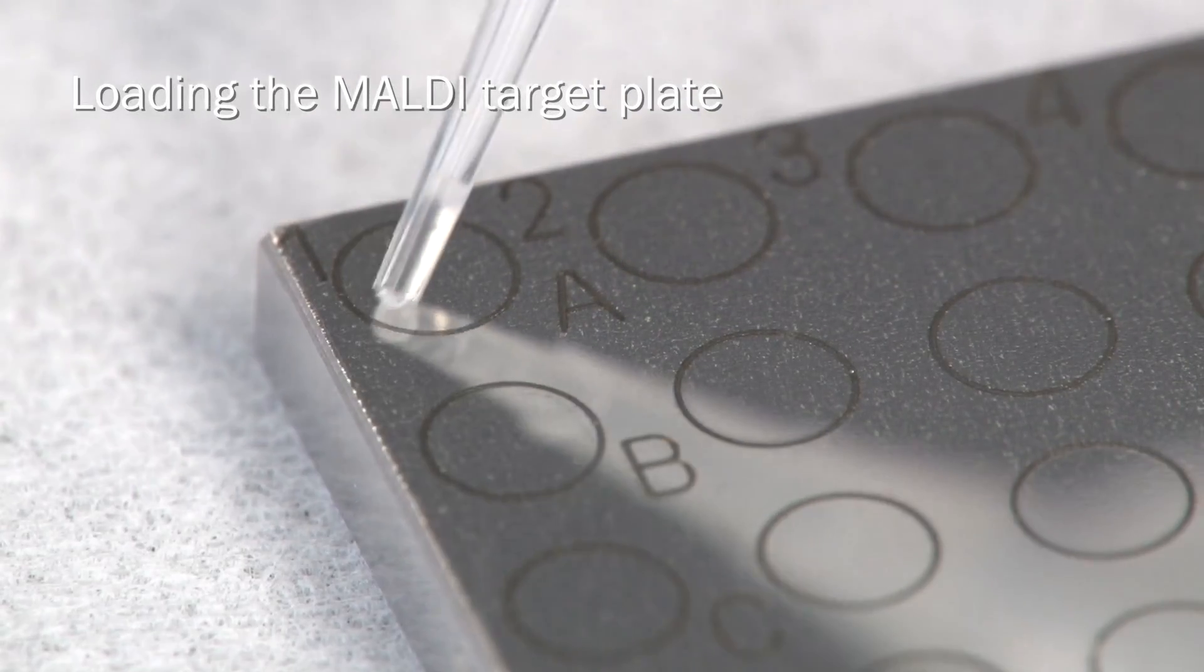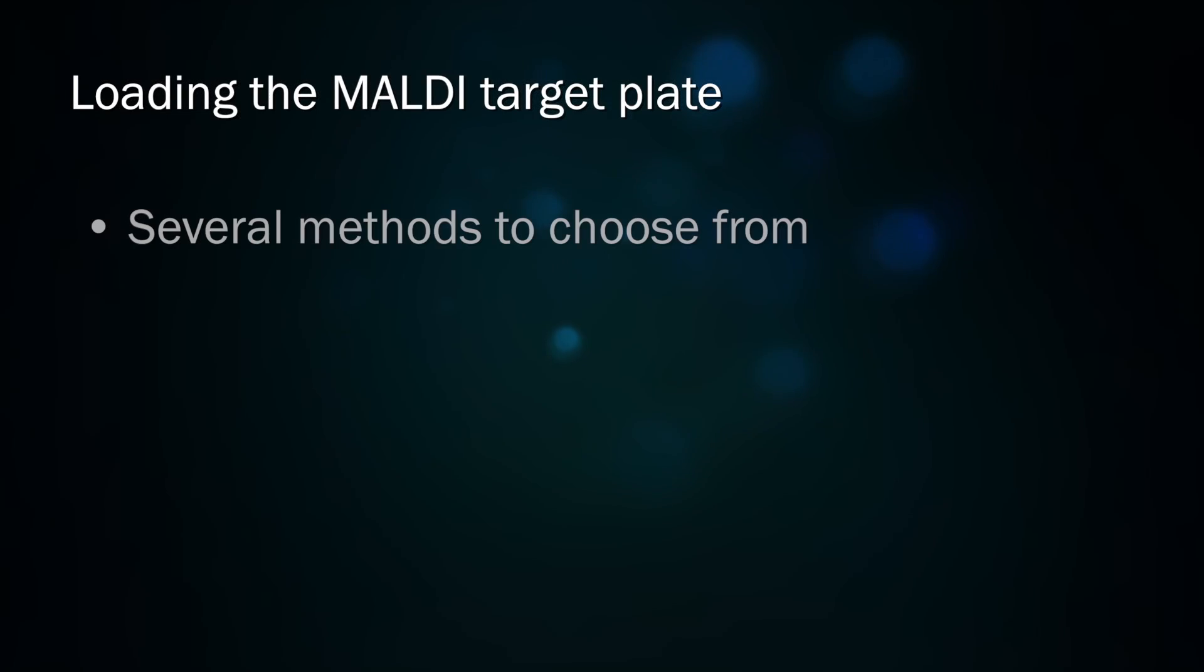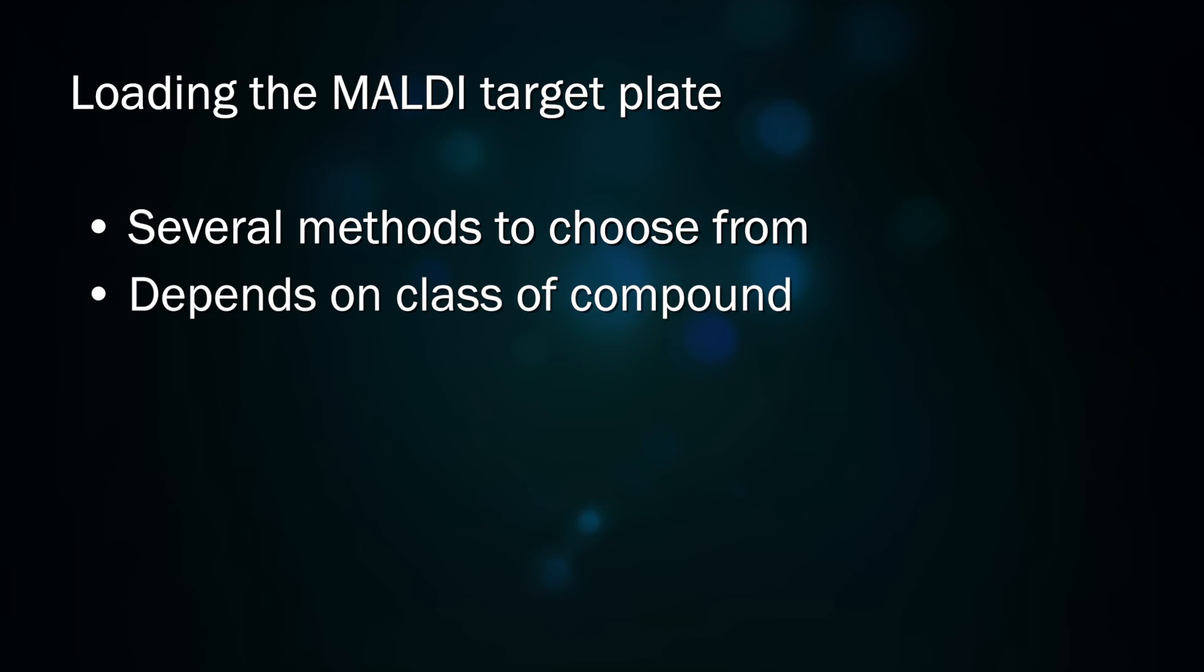When your matrix and analyte solutions are prepared, the sample can be loaded onto the MALDI target plate using a number of different methods. The method you choose will depend on the class of compound, but also different methods can be tried to empirically determine the best method. The original technique for loading a MALDI target plate is known as the dried droplet method.